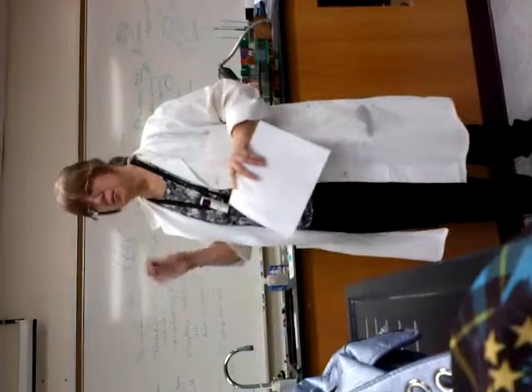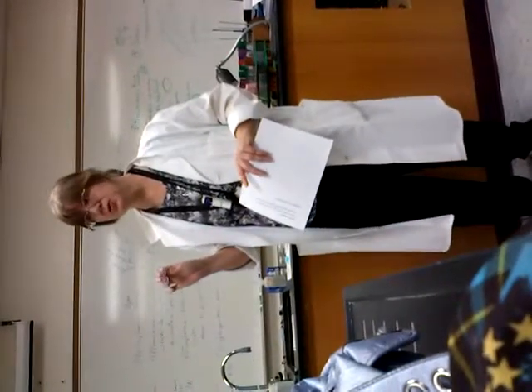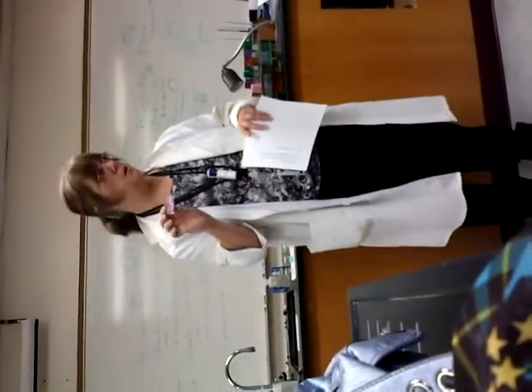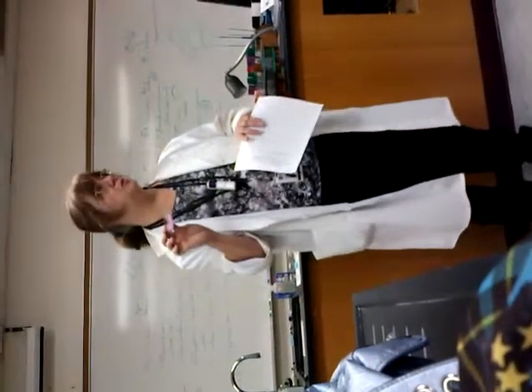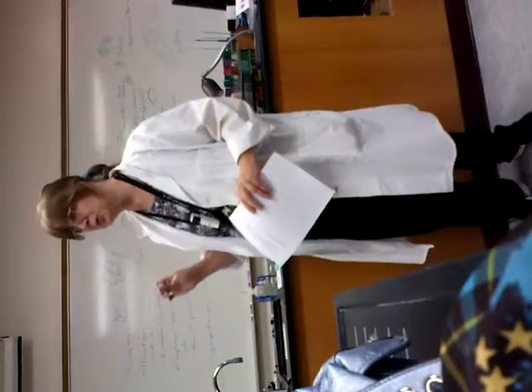You just divide by 40. If you did 100 mils, divide by 100. But you don't report coliforms in number of organisms per mil. How do you report it? Per 100 mils. So first calculate them to organisms per mil, so you won't confuse yourself, because you may have filtered 30, you may have filtered 25, you may have filtered 75. And then multiply times 100, so it would be a number of organisms per 100 mils. That's the standard way you report coliforms.